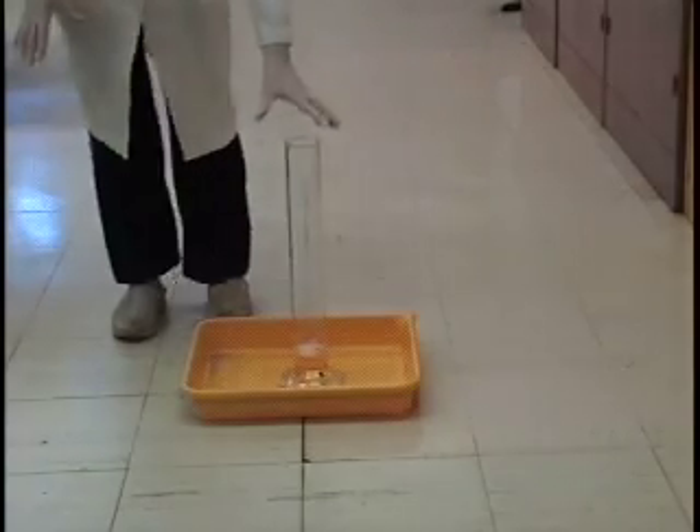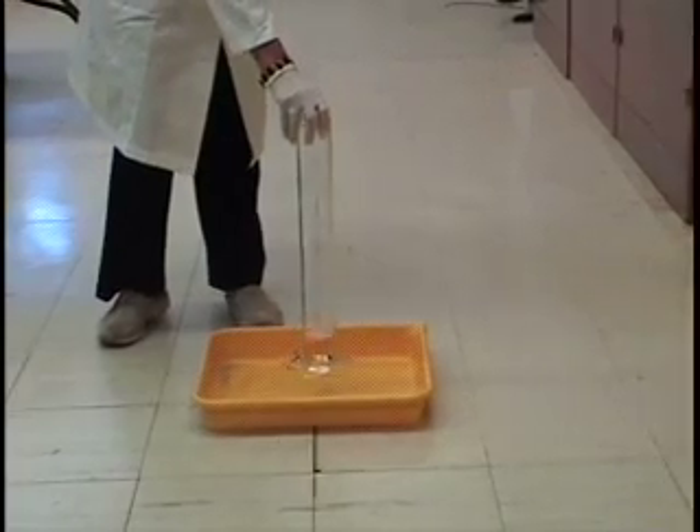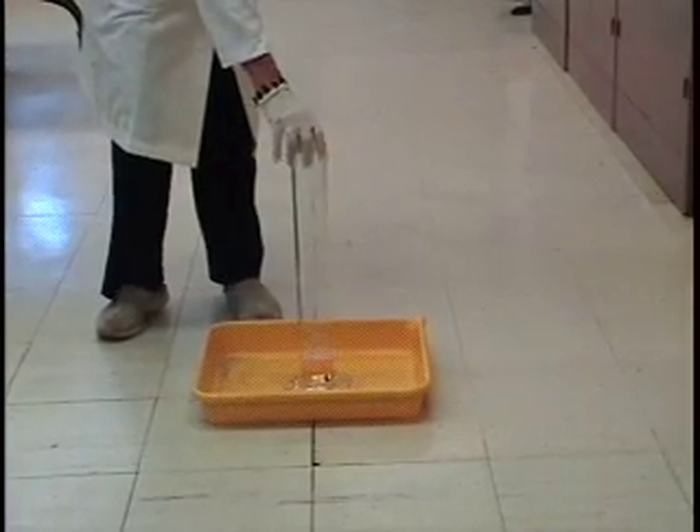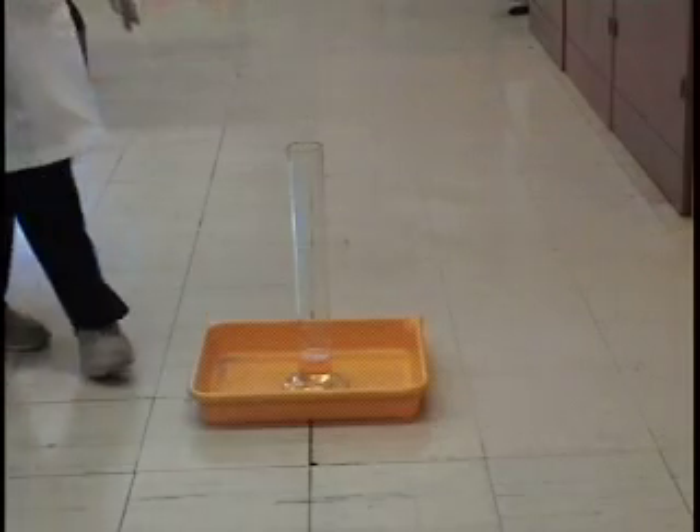What I have here is a graduated cylinder with 80 milliliters of 30% hydrogen peroxide, and to that I have added 40 milliliters of Dawn dishwashing detergent.